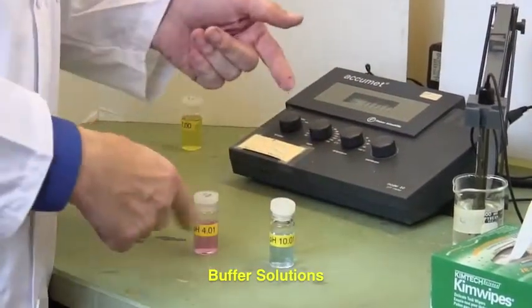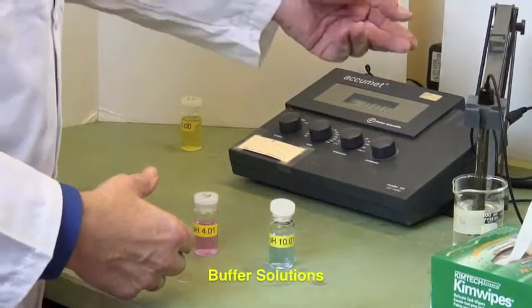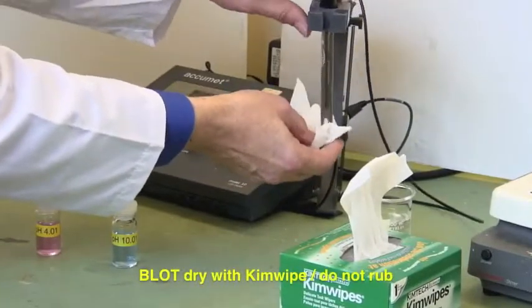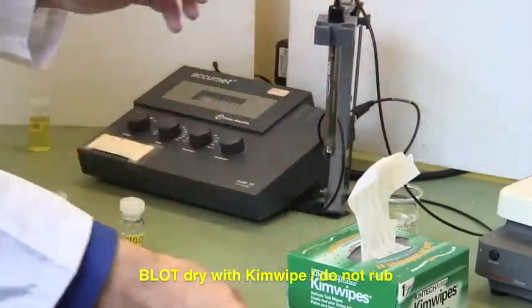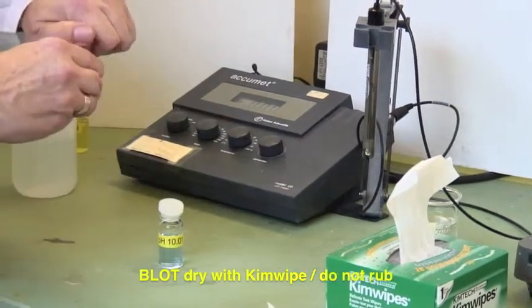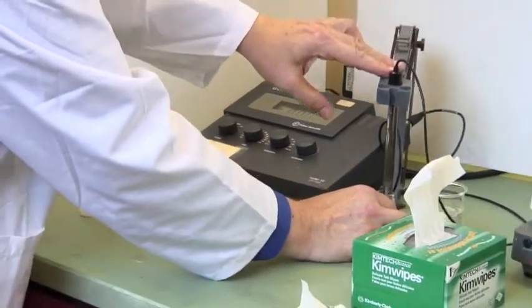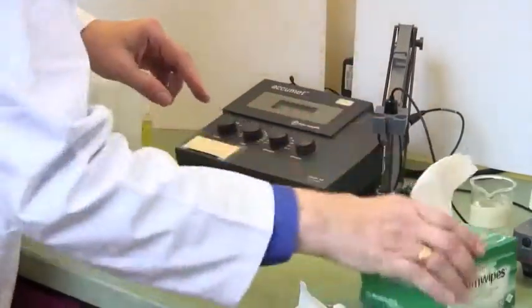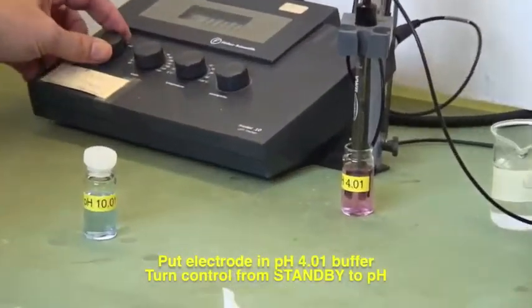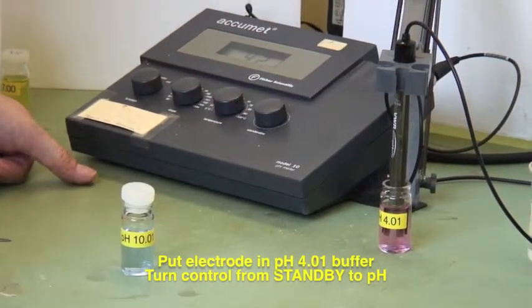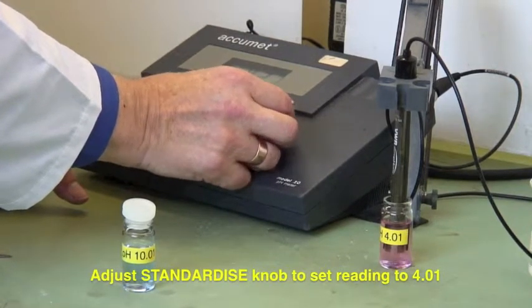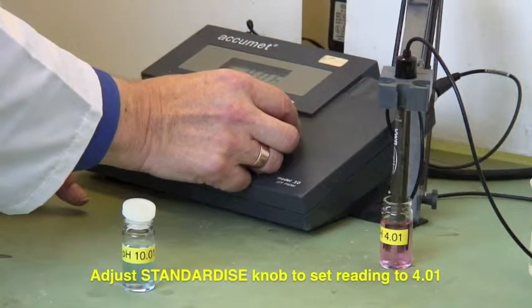Calibrate using buffer solutions in labeled, color-coded vials next to the pH meter. Lift the electrode and blot it dry with a chem wipe—don't rub, as this creates static charge and poor results. Lower the electrode into the pH 4 buffer, which is pink. Turn to pH mode and use the standardize knob to adjust the reading to 4.01.